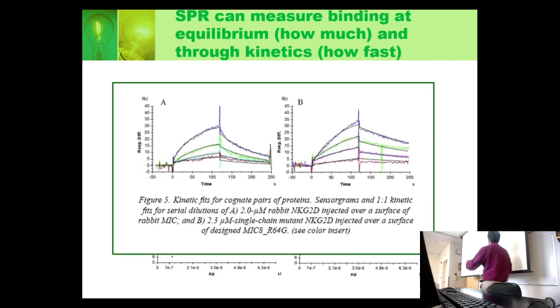The other thing you can do is look not at this point, but at how the line curves up and down. This is chapter 6 and 7 material. This is kinetics. You can see right here how this line's curving down faster than this one. This one is more stable in its off rate because it's falling off more slowly. It's stickier.